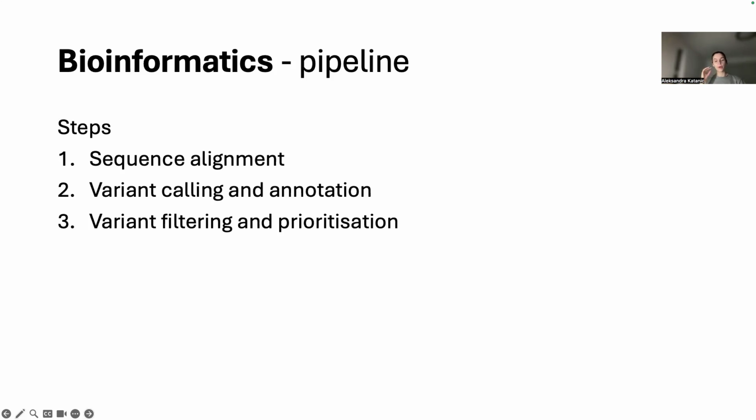Bioinformatics, let's talk about both. I'll go into detail about both pipeline and variant creation and interpretation. So in NGS, short DNA reads are first aligned to a reference genome, as mentioned earlier, and then bioinformatics tools will compare these aligned reads to identify consistent differences, such as a single nucleotide variant, while at the same time filtering out sequencing errors. So this includes the design of algorithms, software tools, and databases that facilitate the integration of statistical, mathematical, and computational approaches and pairing them with molecular biology and genetics.